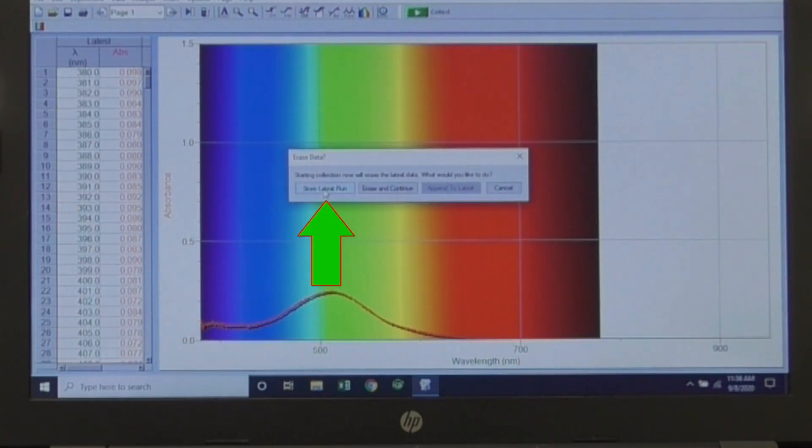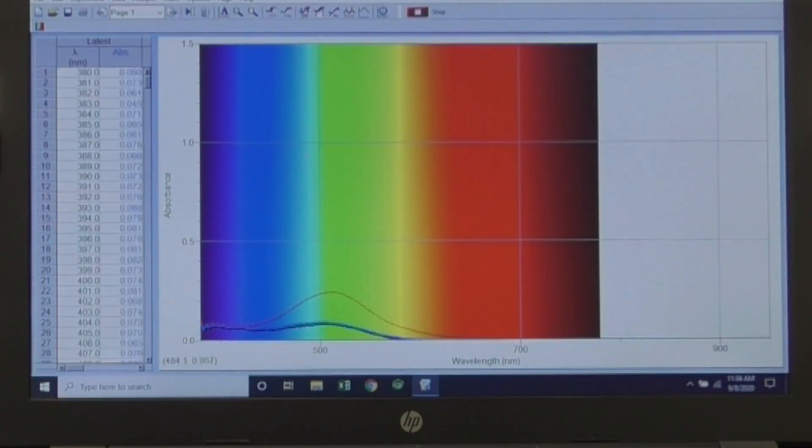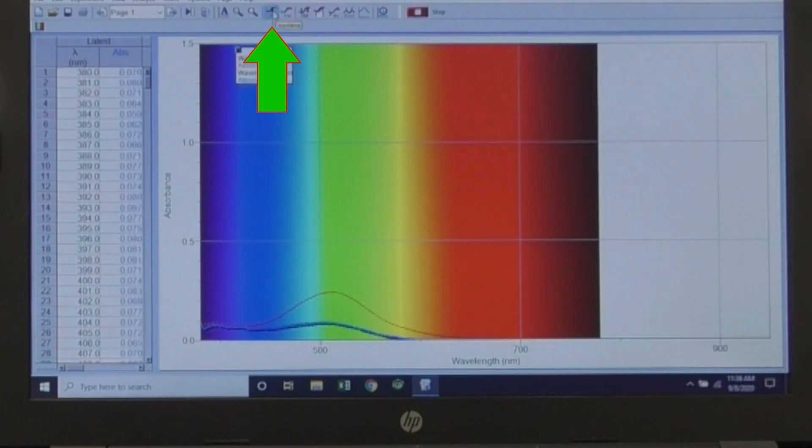Using the examine tool, write down the absorbances at 520 nanometers. Notice that this may not be the highest point of your peaks.